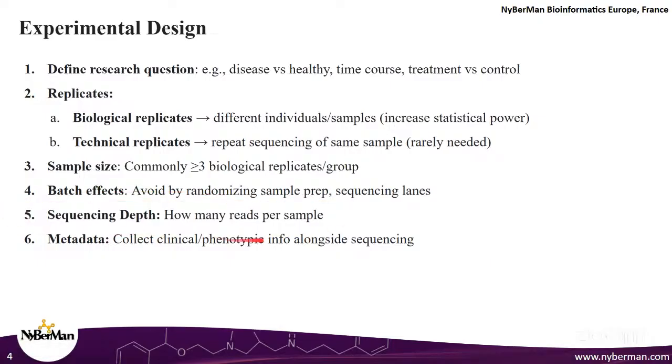So this is kind of like a hypothetical number: this is the sequencing depth I want, meaning that per sample I want this many reads, say 20 million or 30 million reads per sample. You set this and you actually alter the chemistry, in terms of the sequencing reagents and the sequencing run on the machine, to achieve this, right?